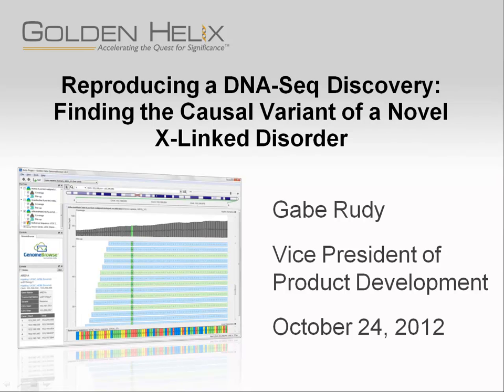What we're actually going to do is, both in a sort of story form and in an interactive live way, reproduce the results of a DNA sequencing discovery, really about finding a single causal variant for a novel X-linked disorder.